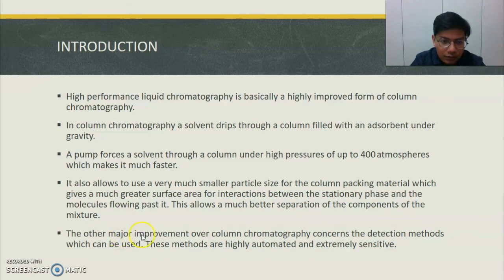The other major improvement over column chromatography concerns the detection methods which can be used. These methods are highly automated and extremely sensitive.